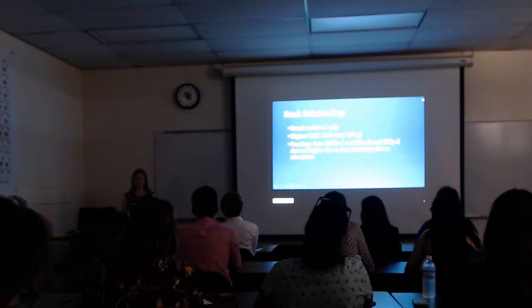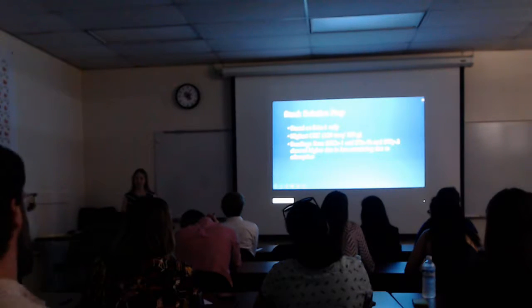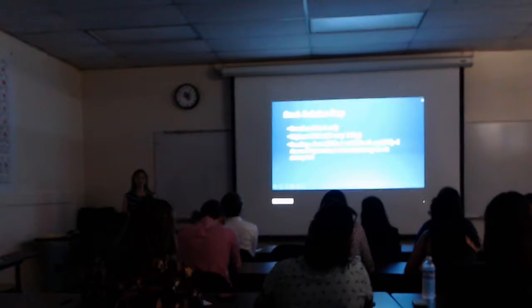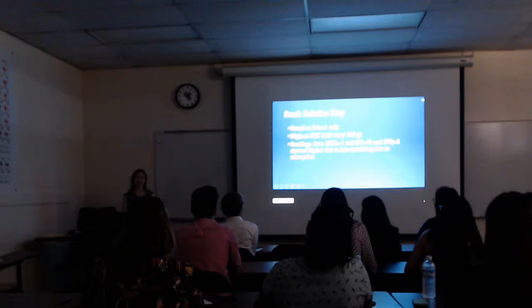When we did this, we also created a stock solution. We based it solely on the Arizona clay because it had the highest CEC of 120 milliequivalents per 100 grams. And unfortunately, taking the easy way out to not have to do more dishes resulted in skewing the data for the California, Texas, and Wyoming clays higher because clays are very good at adsorbing ions.